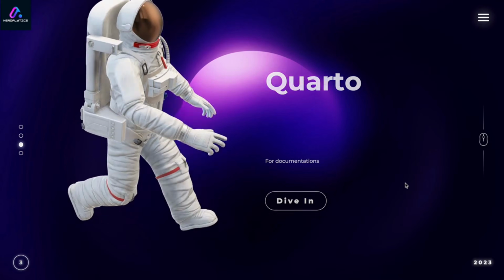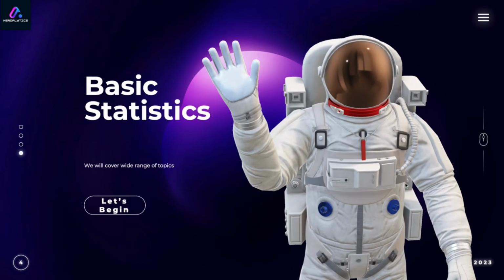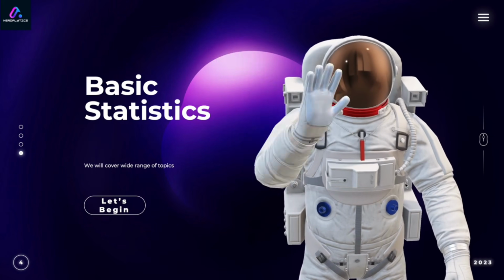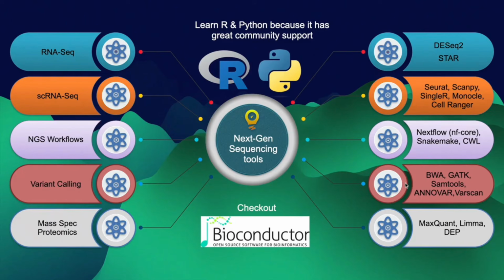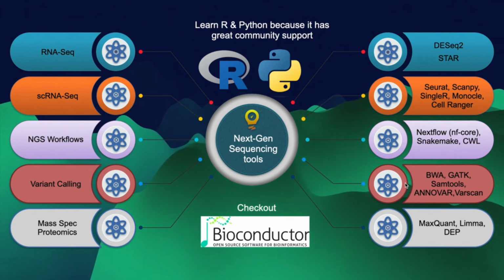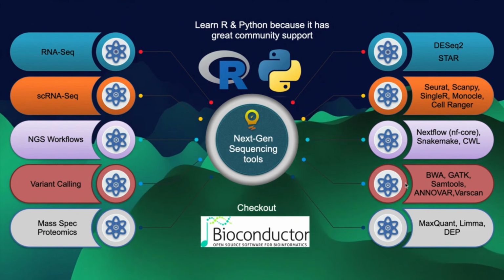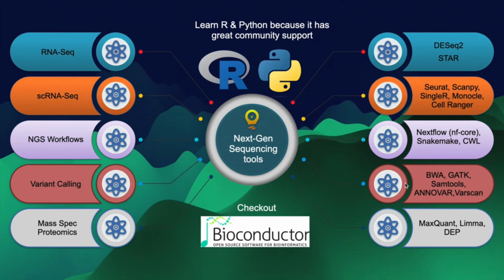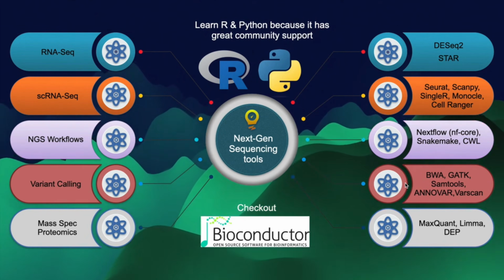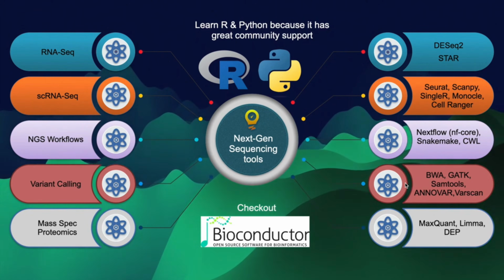For the later developments or advancements, I would recommend everyone to have some basic statistics knowledge, because we are going to dive into many different packages in R, and we'll be covering mostly all the aspects of DESeq2, Seurat, single cell sequencing packages, Nextflow, variant calling, and even mass spec proteomics, MaxQuant, limma, DEP package, all those things.